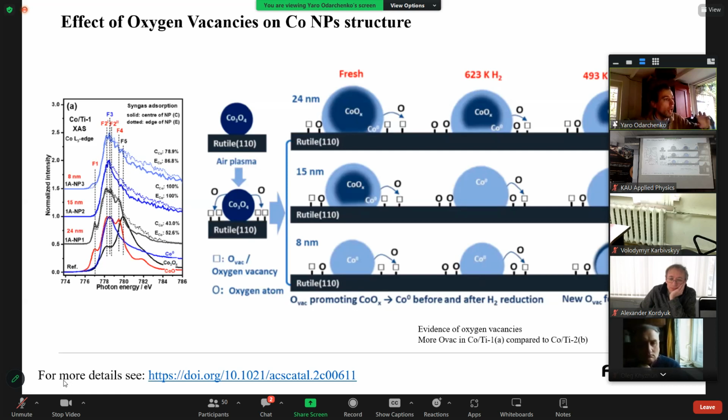It was not possible, obviously, to do a proper in situ reaction, because in this UHV chamber for the microscope you couldn't expose different gases. So we were moving the sample inside the UHV to a so-called prep chamber where we were able to treat the sample, and afterwards move it back and measure again.